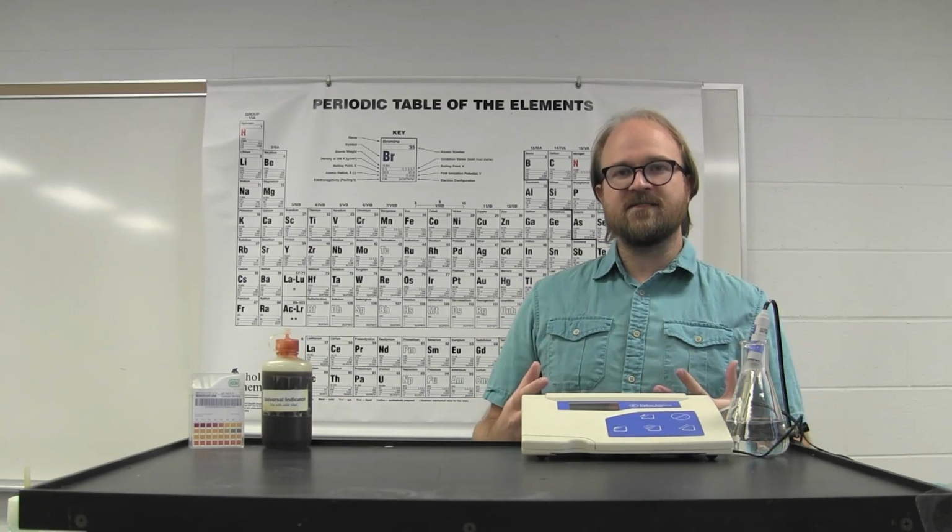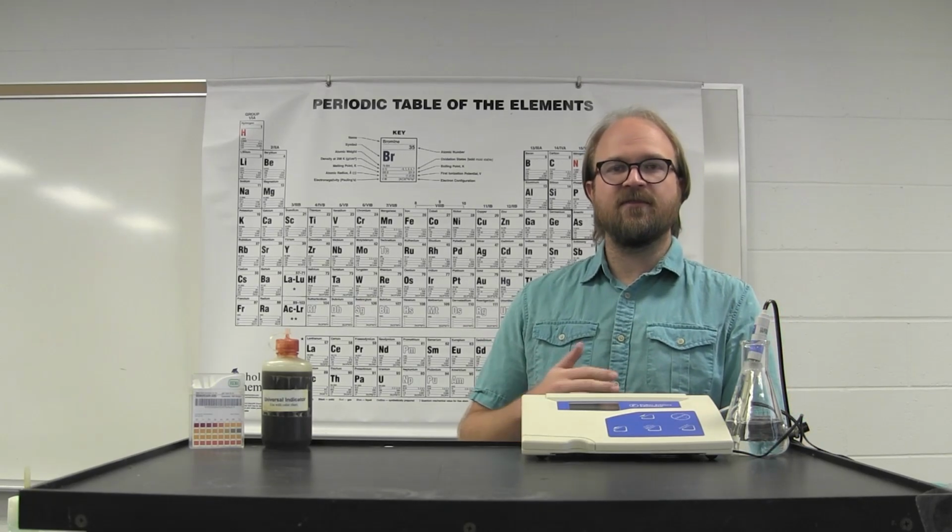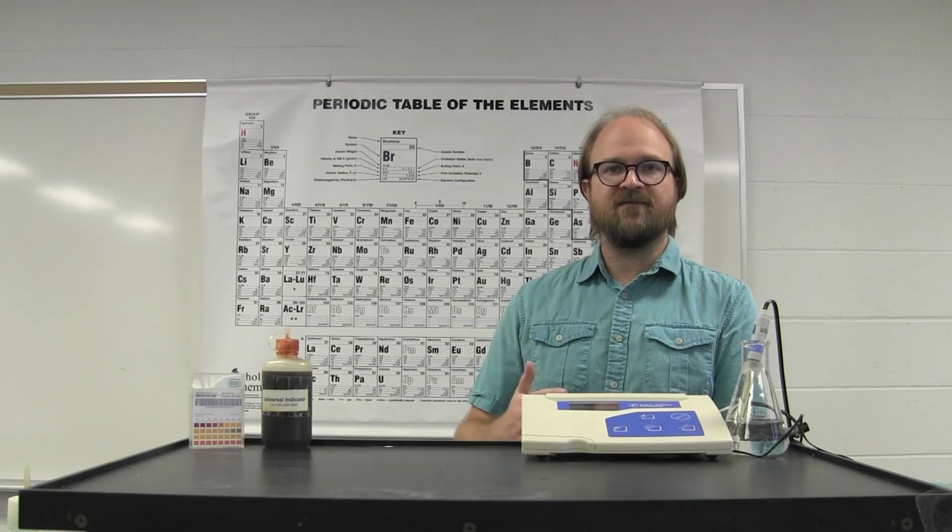So in this experiment, we're looking at measuring the pH of various different solutions, as well as preparing buffers and determining through experiments which buffer is better for these varying types of situations. Which one has a better buffering capacity for an acid, and which one has a better buffering capacity for a base.